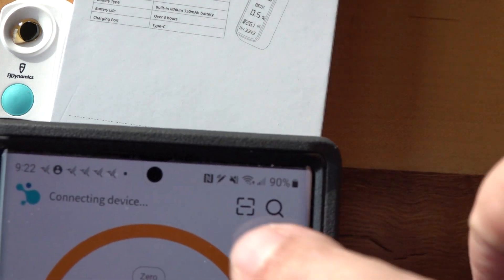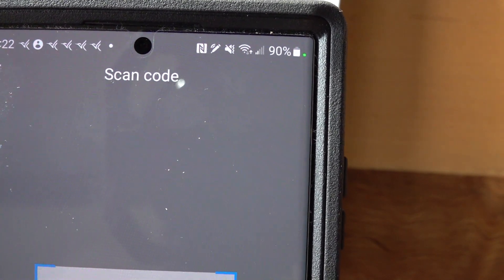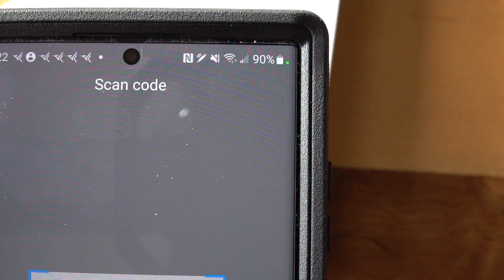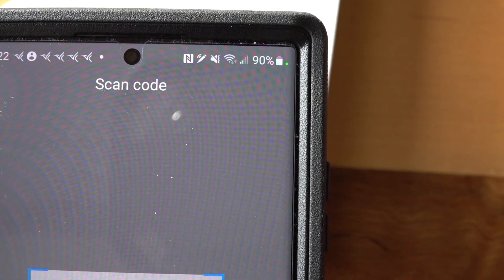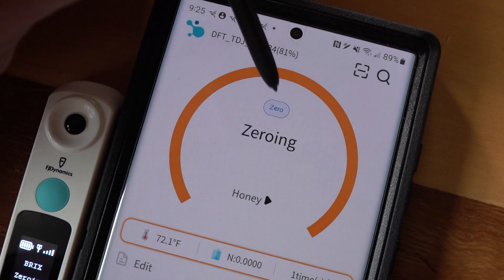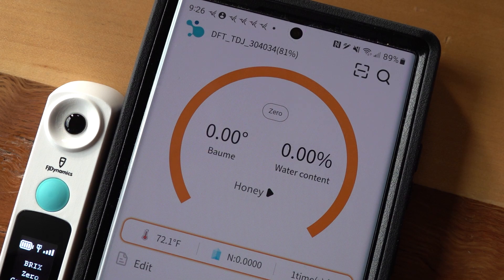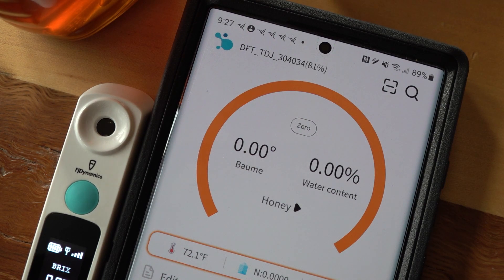They also tell you to scan a code — but note, the sticker on the box is not the code to scan. You need to flip over the pocket refractometer and scan the code on the back to link your app and phone to the device. Once linked, you can see it at the top left. The battery is already down to 81% and we've only been using this about 15 minutes. It claims long standby battery life, but anyway — we're zeroed out at zero percent water content, rated for honey.